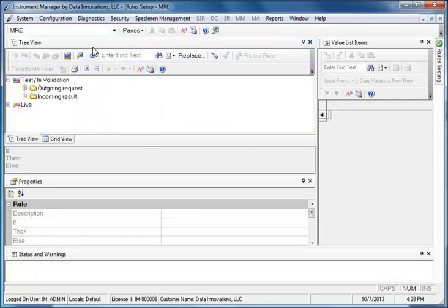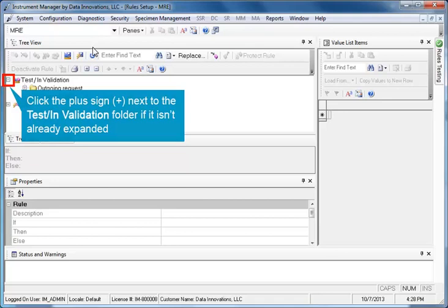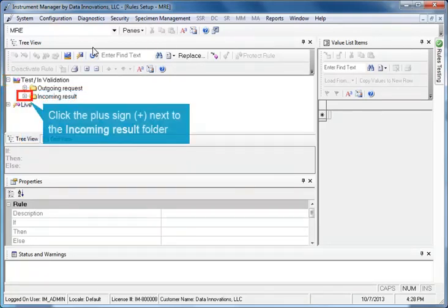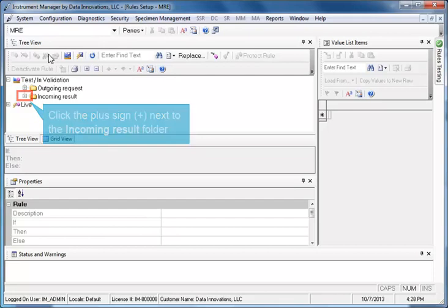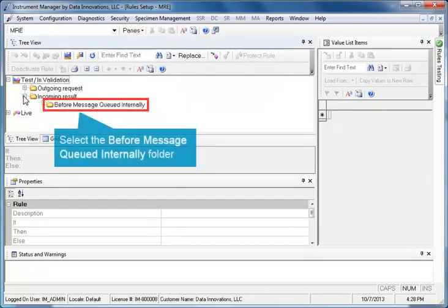In the Tree View section, click the plus sign next to the Test Invalidation folder if it isn't already expanded. Click the plus sign next to the Incoming Result folder, then select the Before Message Queued Internally folder.